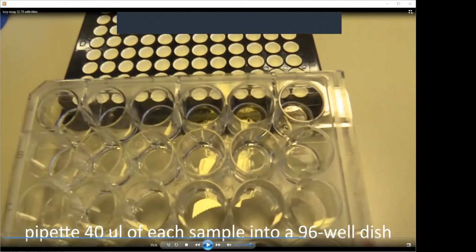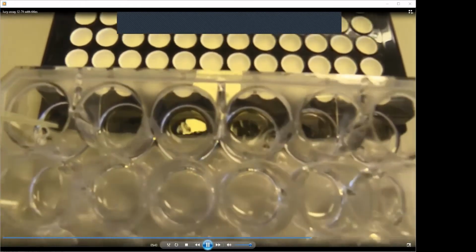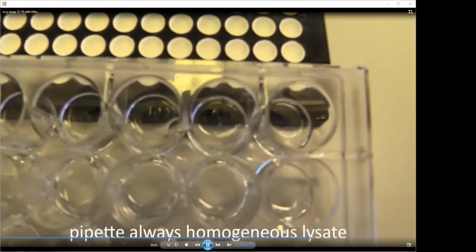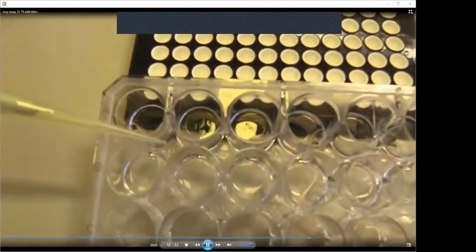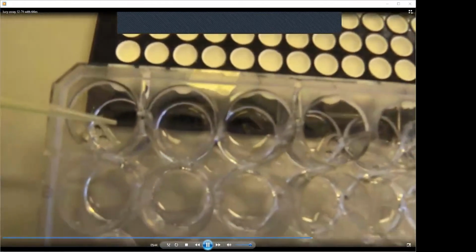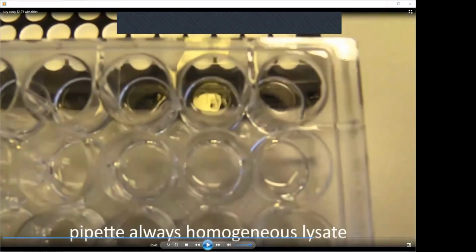So each sample is measured naturally separately. So we have triplicates, always 3 samples, should be the same treatment, should be more or less the same value. Here I have also written that it has to be properly homogenized, so you have to pipette it up and down several times in order to get the same quality of the lysate.